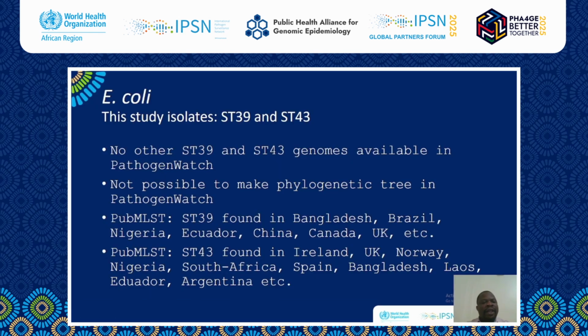Unfortunately, we couldn't build the trees from strains isolated and sequenced for Escherichia coli, even if we got two different sequence types. However, after blasting, we found that the sequence types observed in this project have already been mentioned elsewhere around the world.